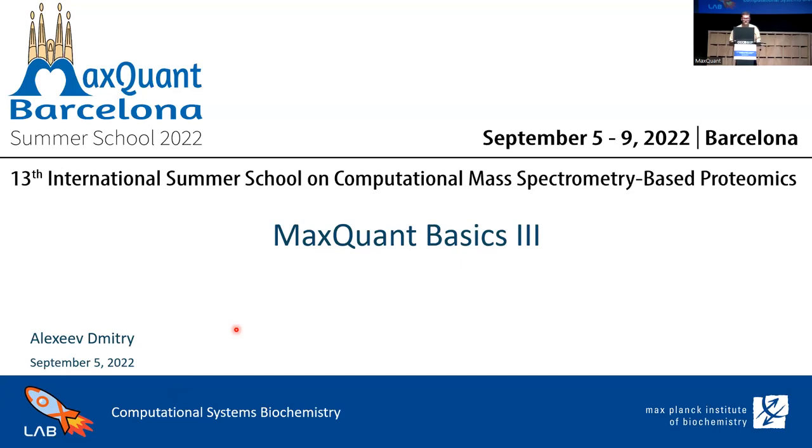Me, on the other hand, I'm like a Barcelona heat coming to you with more computational stuff. And speaking of which, I'm going to talk about protein modifications and how MaxQuant can identify those.